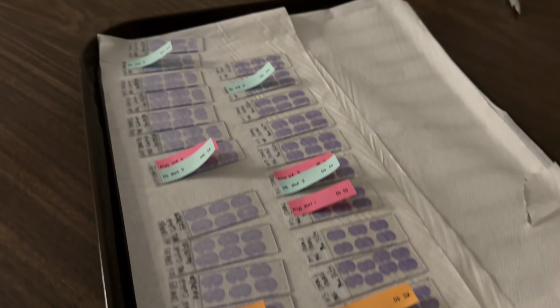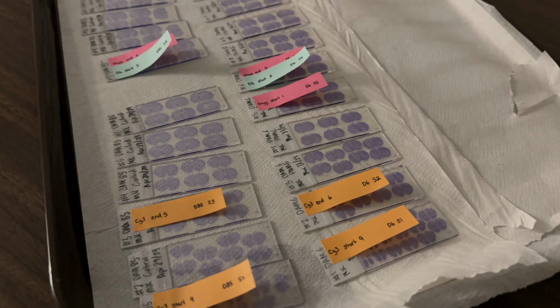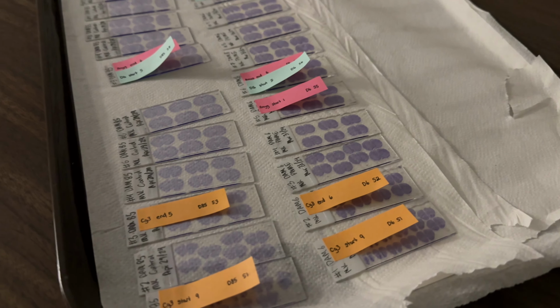Hello from the lab. I'm speaking quietly because I don't want to interrupt any of the other labs, but I can walk you through what I'm doing because there's no one else in my lab today. So these are all brain slides here, and they're tabbed depending on what area of the brain that we're going to analyze in the microscope.